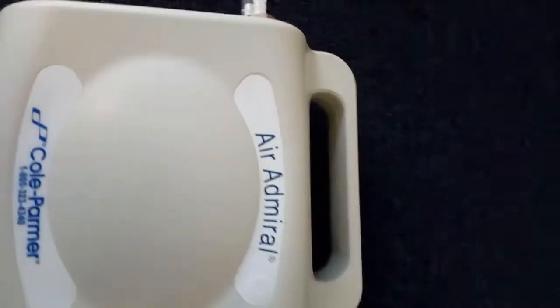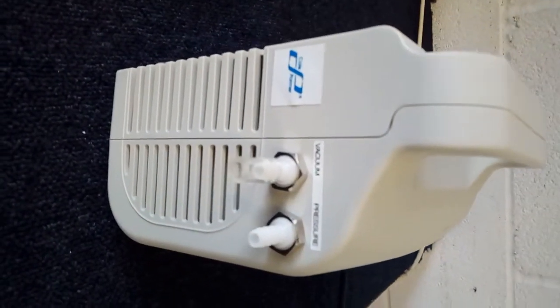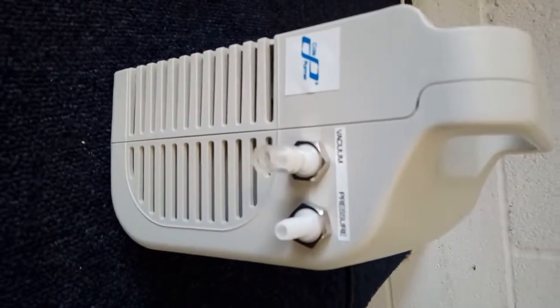I will now switch on the Air Admiral. As you can see at the sides, there is a vacuum nozzle and a pressure nozzle.